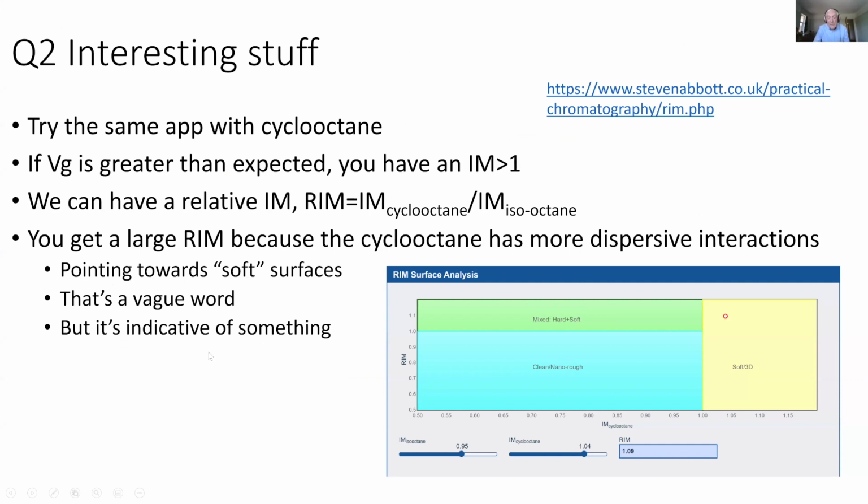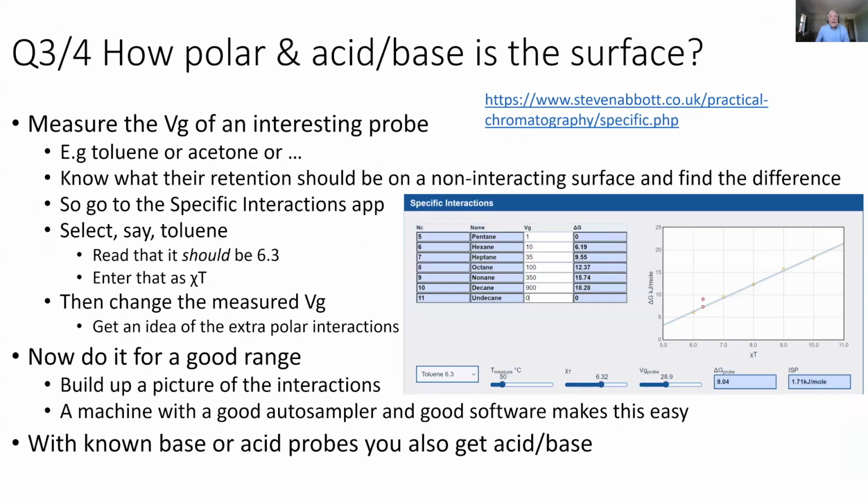It's really clear, this difference. Then how polar and acid base is the surface. Hopefully you're in the routine now, so you find the specific interactions app. I didn't call it polar because there's more to life than polarity, so specific interactions.